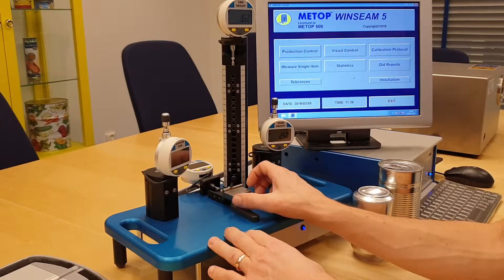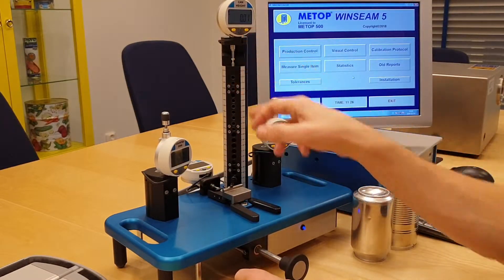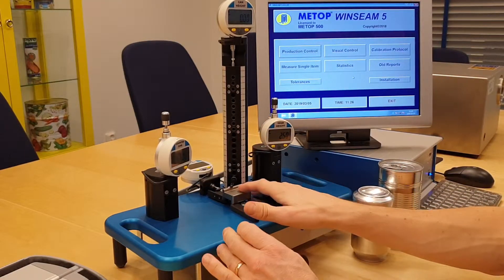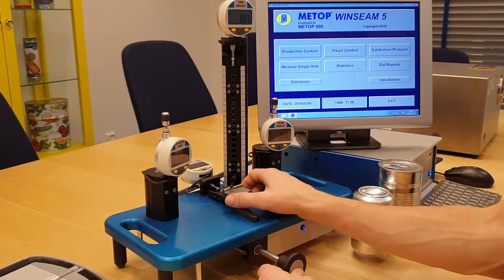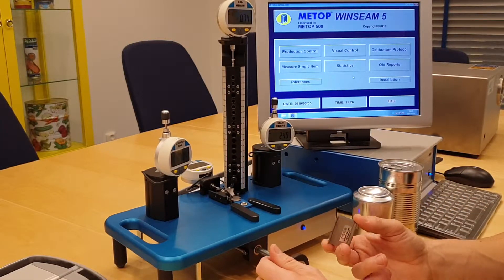You put it in position. You click on each digital indicator to reset to a preset value that correlates with this specific calibration block. Every calibration block comes with a certificate of course.